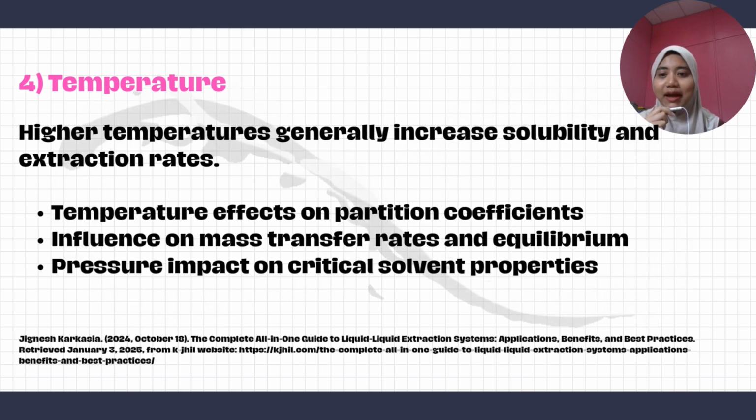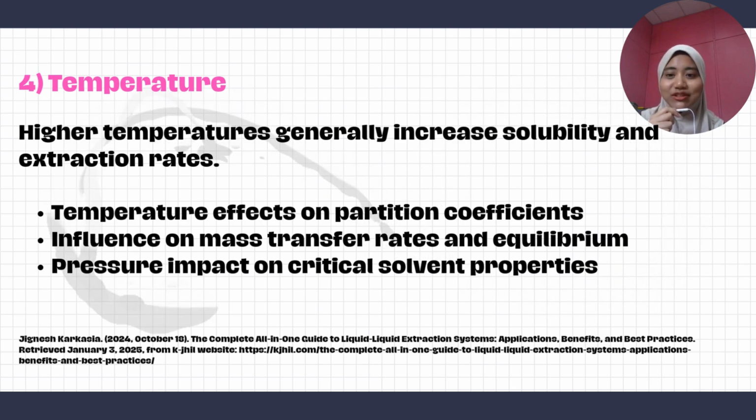And third, the pressure impact on critical solvent properties. Taking all of these points into consideration, we can choose a proper temperature to make sure the LLE process can be done effectively.